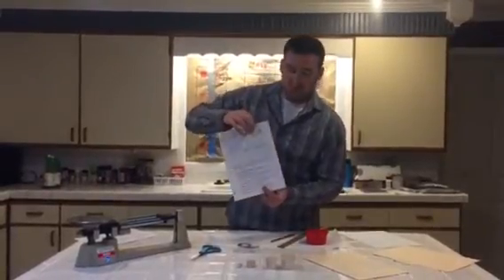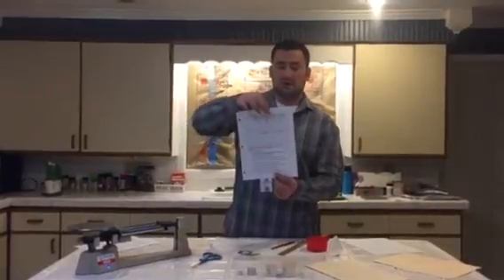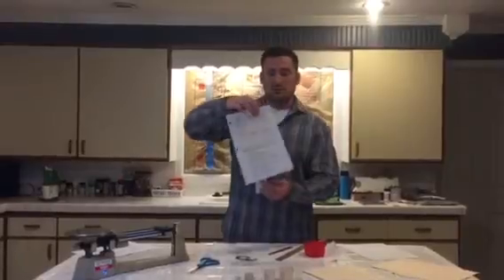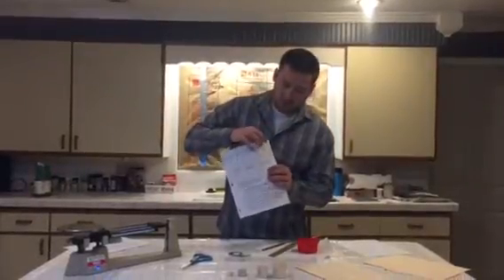Then we would take the distance, so we would take the cell unit size, which would be 2, and divide it by 2, which would give us 1. So that would be the distance, 1 centimeter from the edge to the center of the cube, or the cell. And then we're going to weigh them.